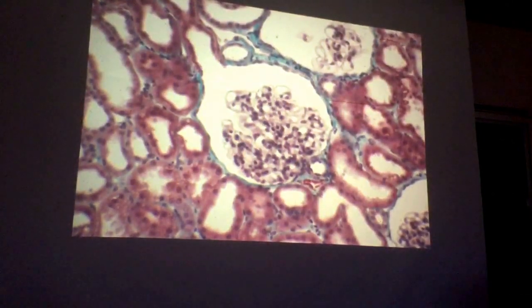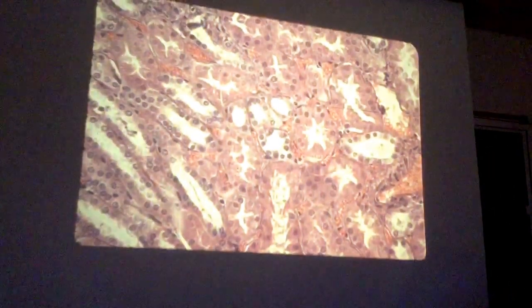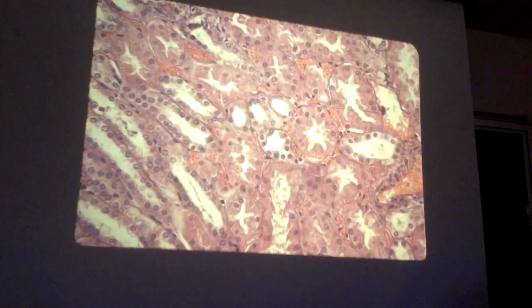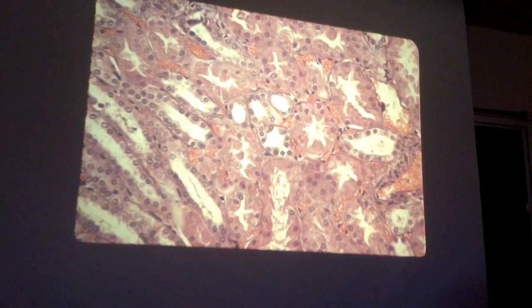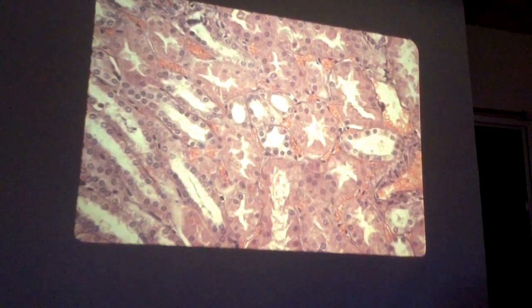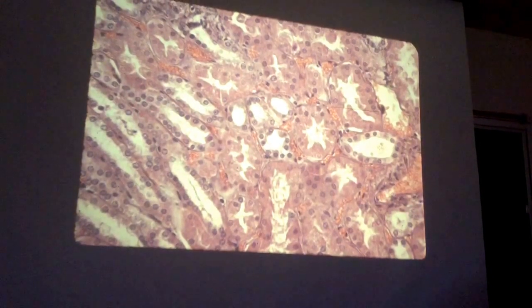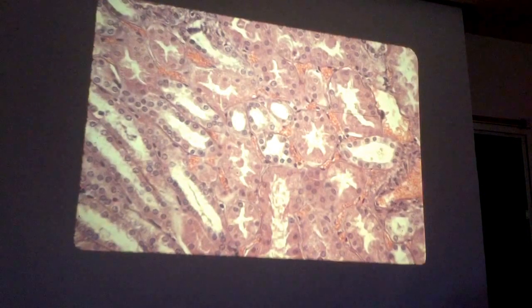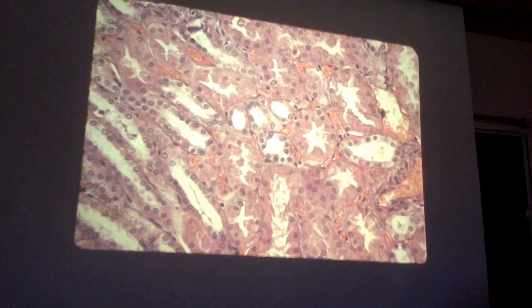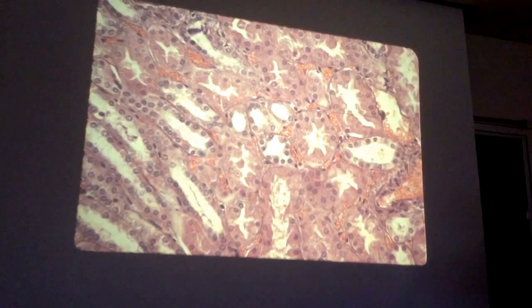And what is this right here? Urinary pole. Okay, and this is what? It's a proximal convoluted tubule, nice stellate-shaped lumen, and collecting duct may be over here. And then we have distal convoluted tubule, there's one right there, and normally on those you can usually see the boundaries between the cells. Difficult to do with the proximal tubule because of the interdigitation of the adjacent cells.